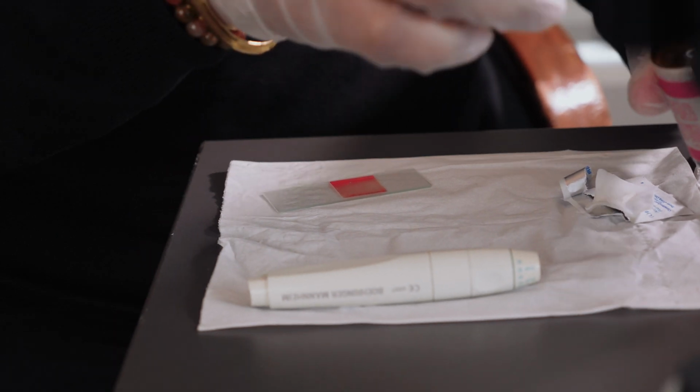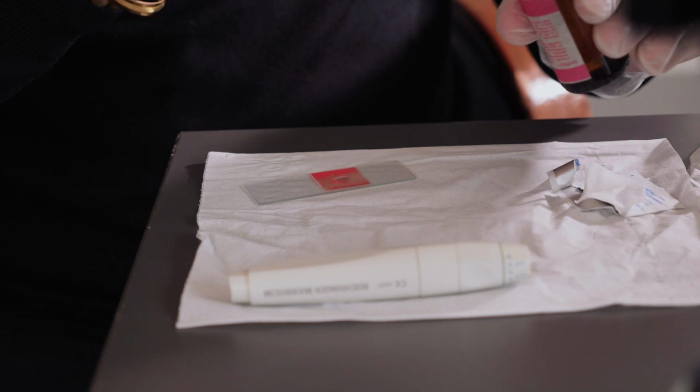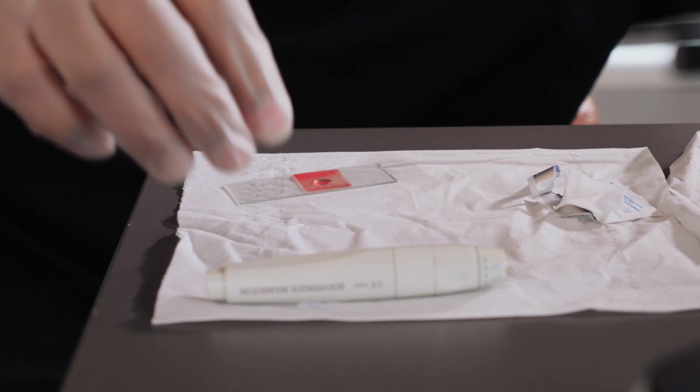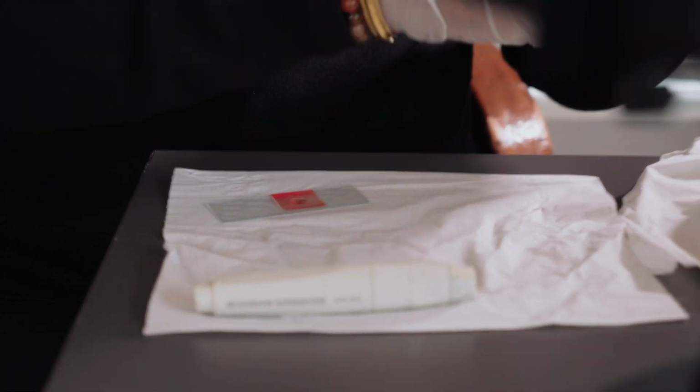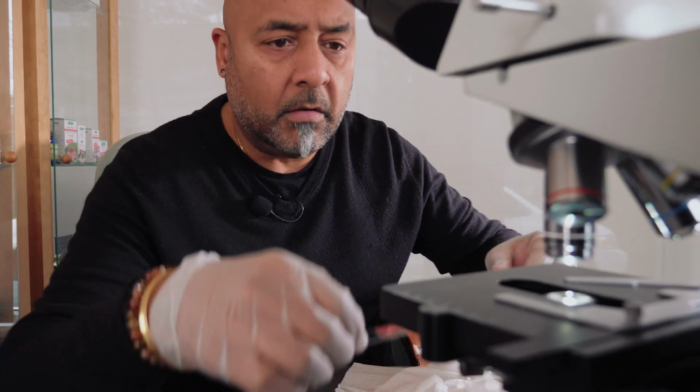Awesome. So what we do, we just put a little bit of what's known as an immersion oil over, just allows us, it doesn't actually come in contact with the blood, but it allows us just to look at the blood much, much better. I'll just pop this to the side for now and we'll take care of that later. So let's pop this onto the microscope and see what's going on.